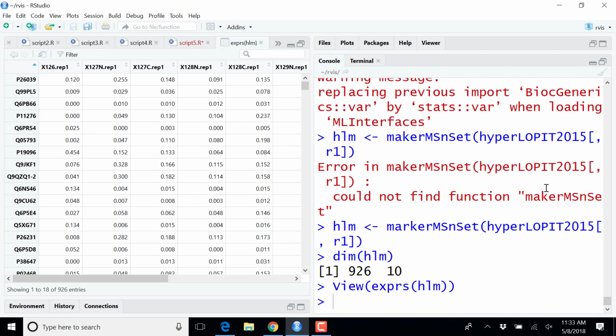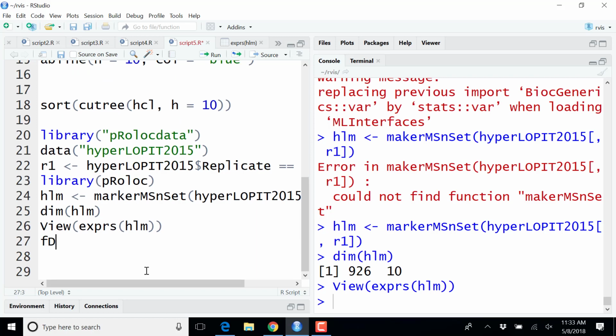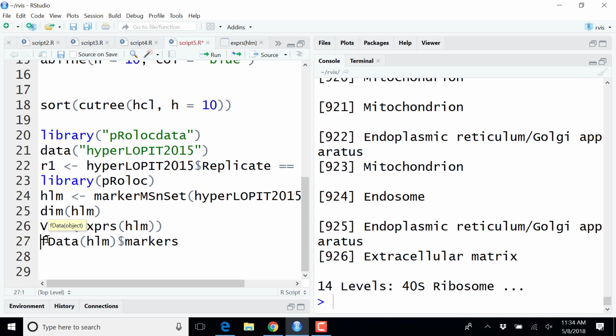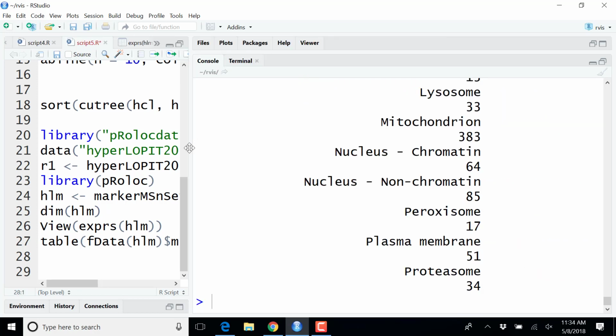But instead of doing this calculation on this data set immediately, and this would give us a tree with 926 leaves, final nodes, and this is the kind of tree that becomes difficult to reason with, to visualize, the suggestion is to say, well, let's not use all the proteins, but let's use a subset of proteins. Sorry, let's see. So here, run this.